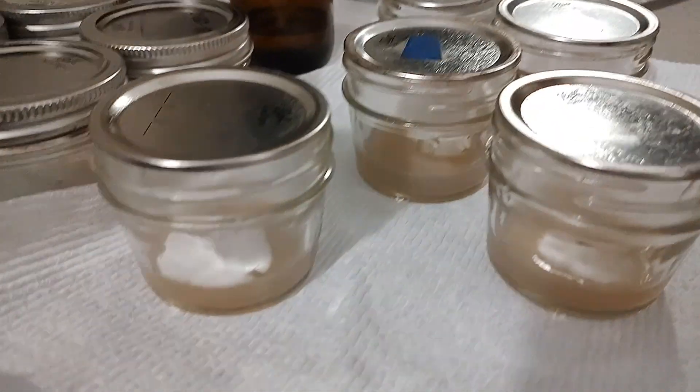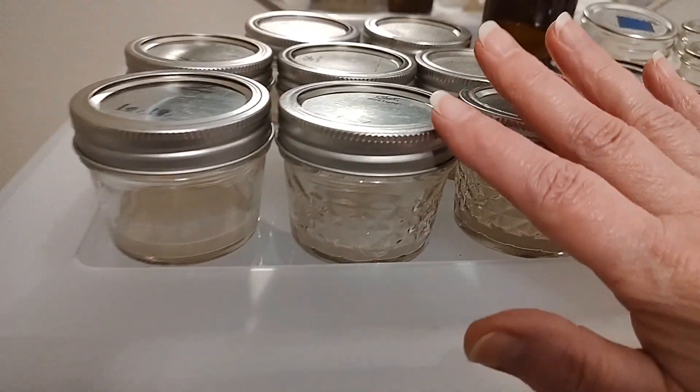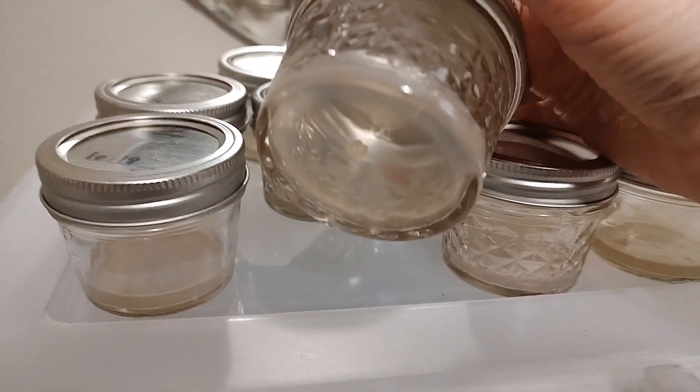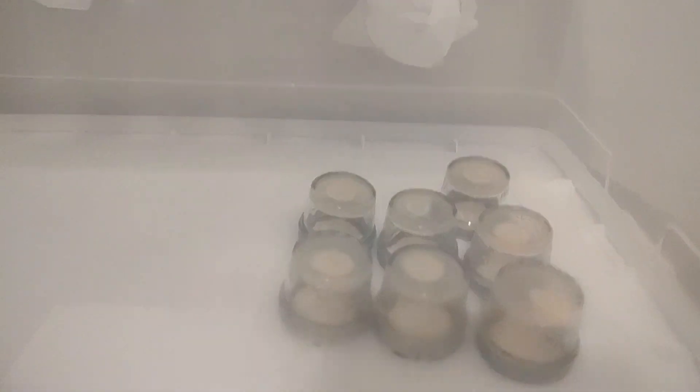I'm finished with these, so I'm going to toss all that — those are clones, we don't need those. These are going to go in our cabinet until they're ready for the next transfer, and I will clean all of these once more, just like these are going to get cleaned.